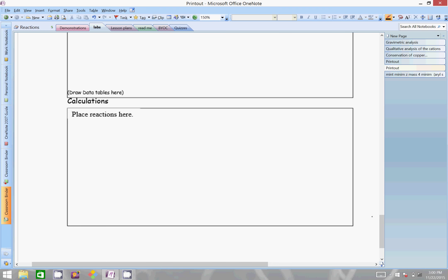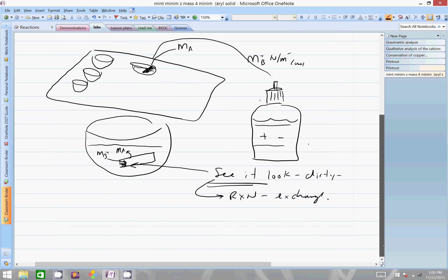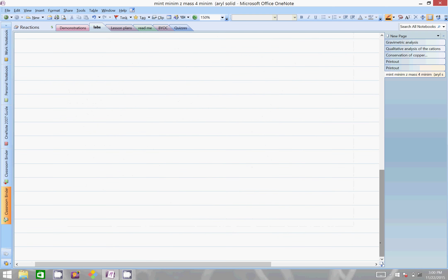You need to do all of your reactions before you come to class. I have my four metals: copper metal, magnesium metal, zinc metal, silver metal.